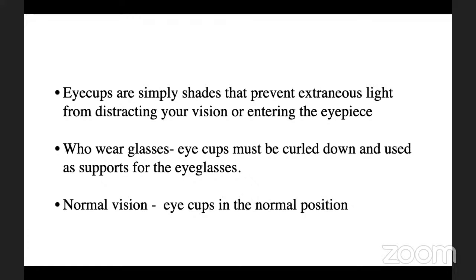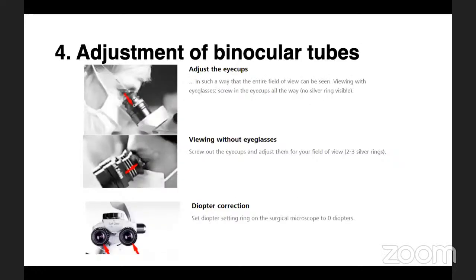Eye cups are simply the shades that prevent extraneous light from distracting your vision and entering the microscope. Those who wear glasses can curl in the cups. Those who don't wear glasses can keep the eye cups in the normal position.